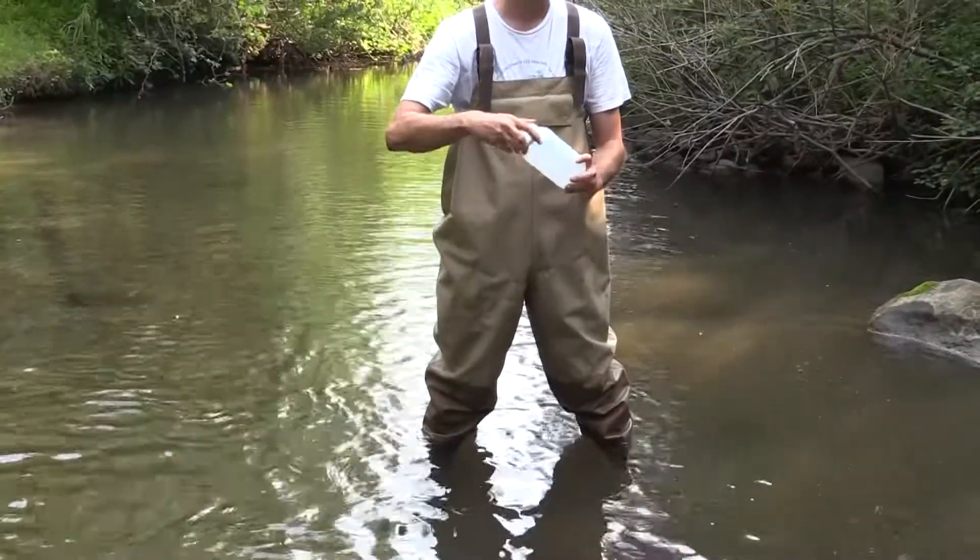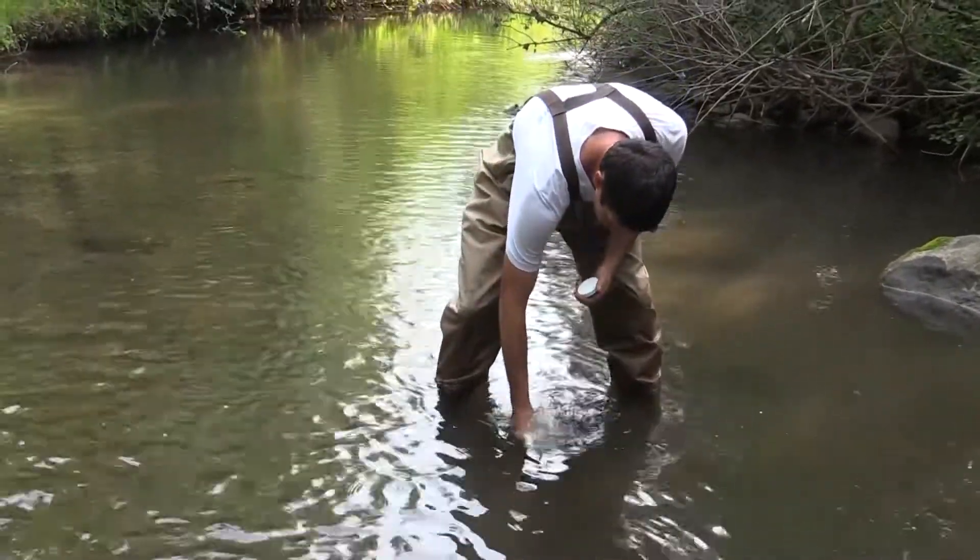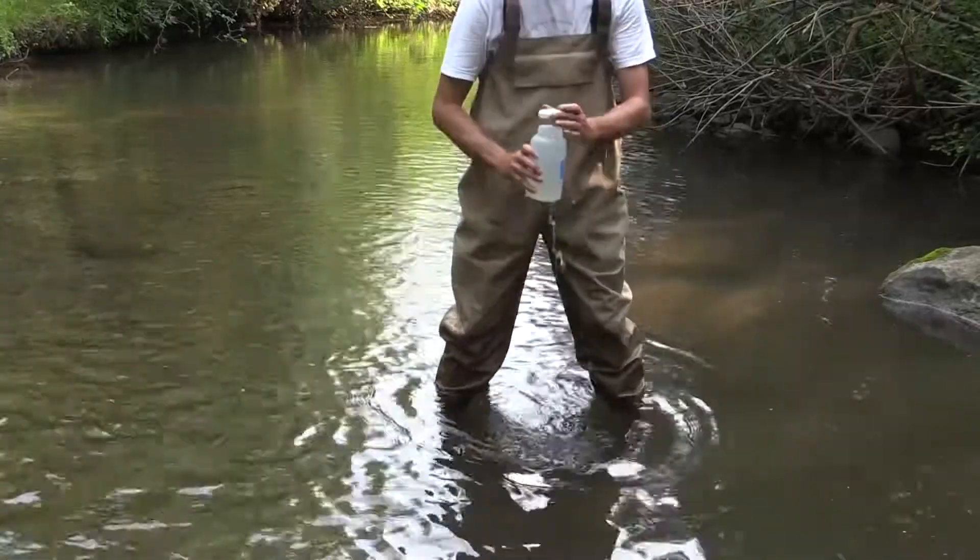Now unscrew the cap, making sure not to touch the interior of the bottle or the bottle lip. Before collecting the sample, rinse out the bottle three times.